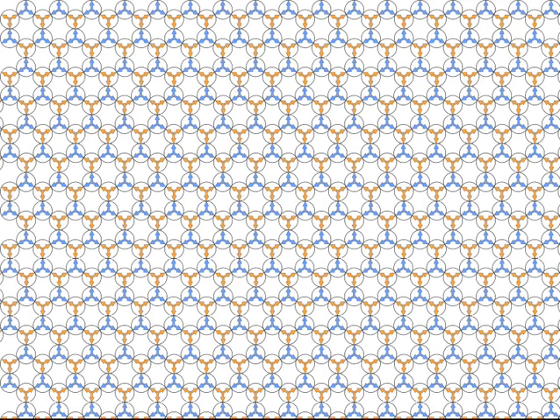Depending on how much scaffold you have, you can expand pretty far in the x, y, and z directions, and you can imagine trying to approximate a wide variety of shapes.